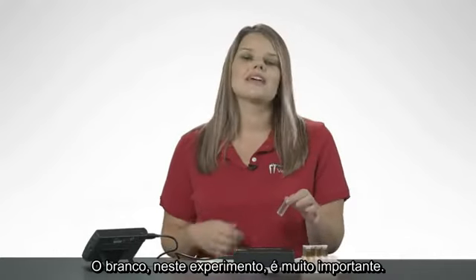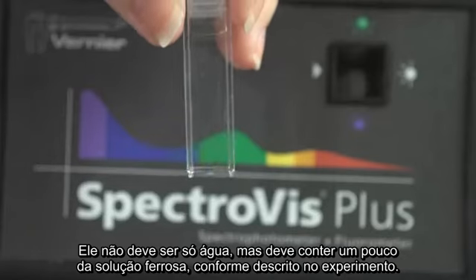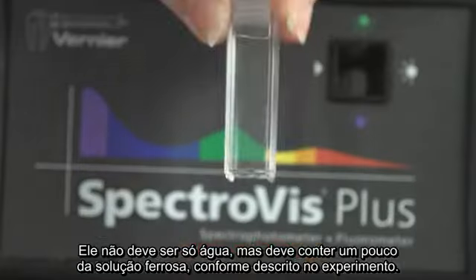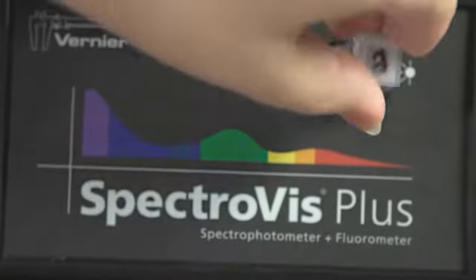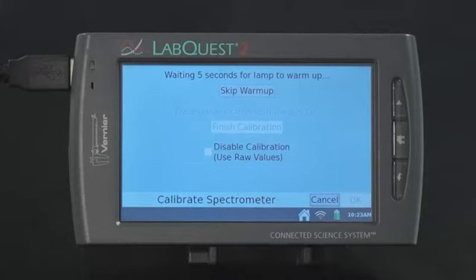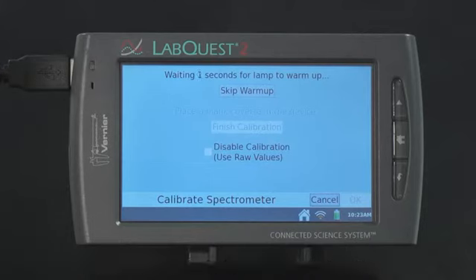The blank in this particular experiment is very important, in that it is not water, but actually contains some of the iron solution as written out in the experiment. Make sure the clear sides of the cuvette follow the path length that is indicated by the arrow on the spectrophotometer. Make sure you've waited the full 90 seconds for the lamp to warm up before you begin the rest of the calibration procedure.